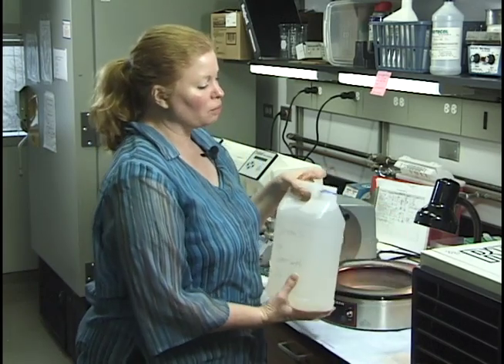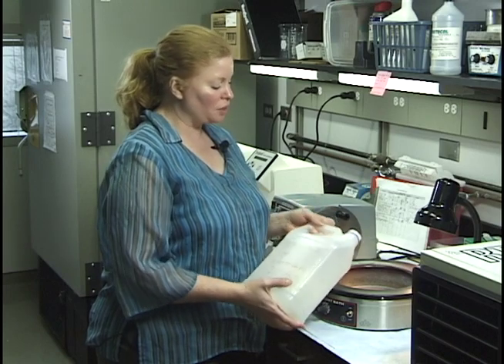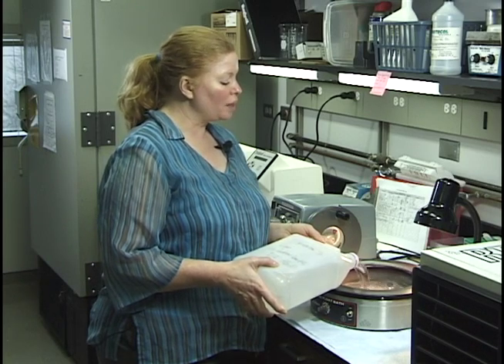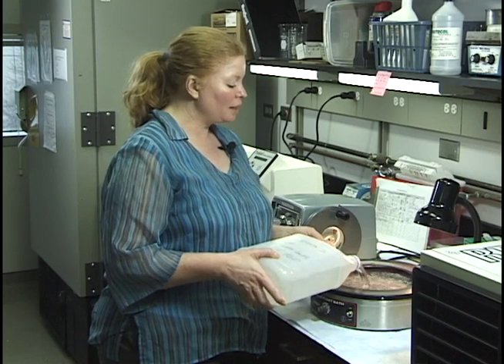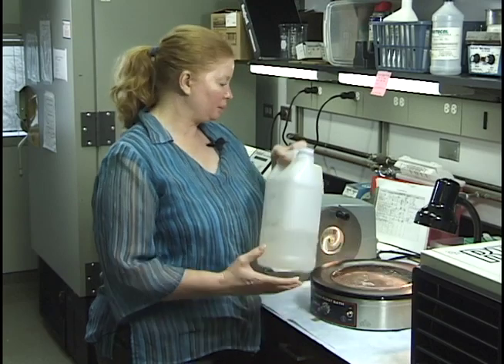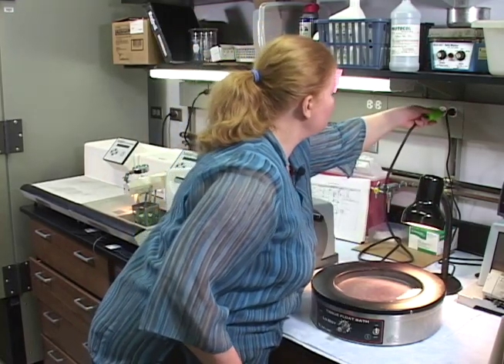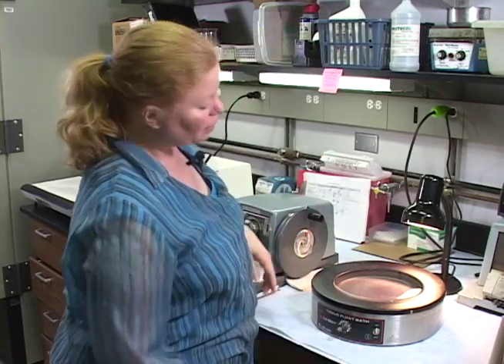For our general purposes in immunohistochemistry and routine staining, we're just going to fill this. I actually fill this completely. Over time it evaporates somewhat, and it just helps me to pick up the slides. So I fill it and actually leave a little bit of a meniscus on top. And I save the rest of this for later for my ice. And I plug the machine in, and I make sure the switch is on.